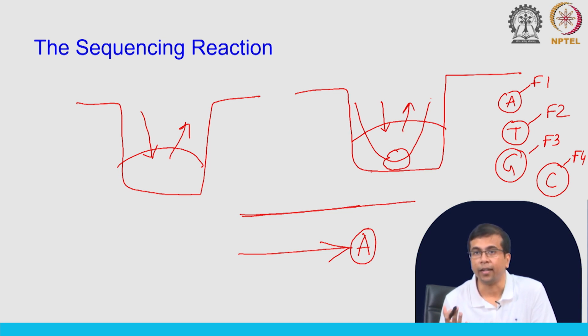And in addition, we can detect these signals in real time because the synthesis is happening at the single molecule level and we are observing those individual base addition events. So, compared to Illumina and 454, this will give us higher resolution, and you will see this kind of real time sequencing will have some other applications. We will discuss that later on when we actually talk about those applications.